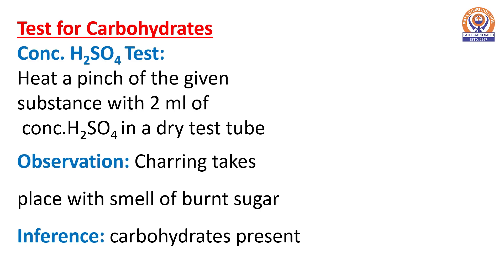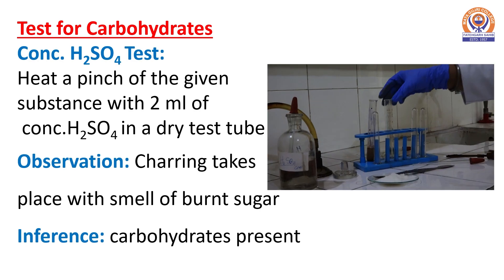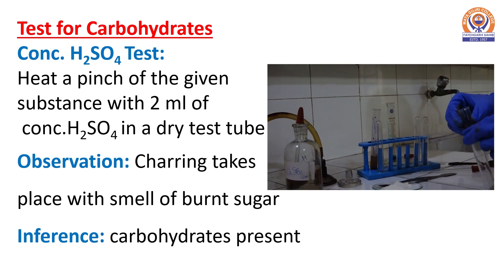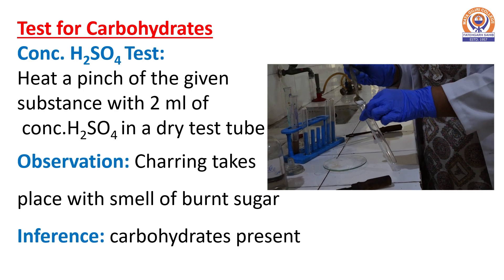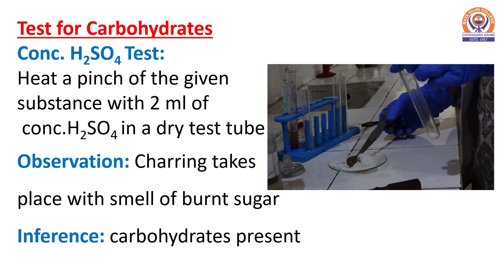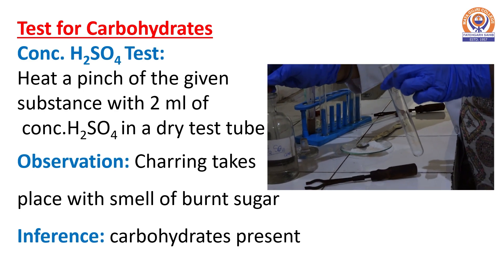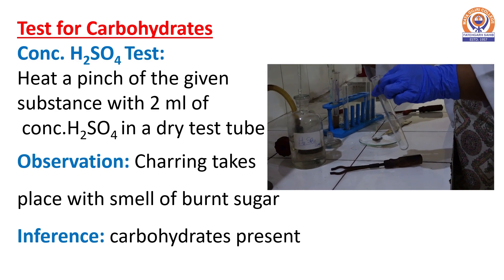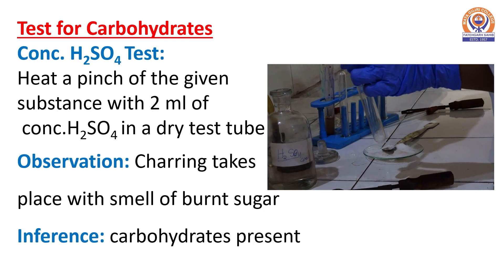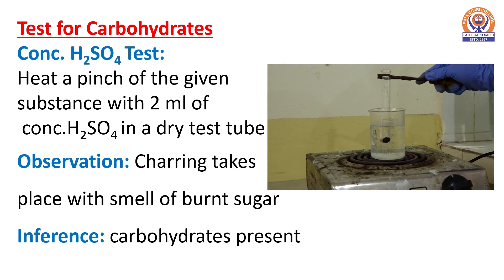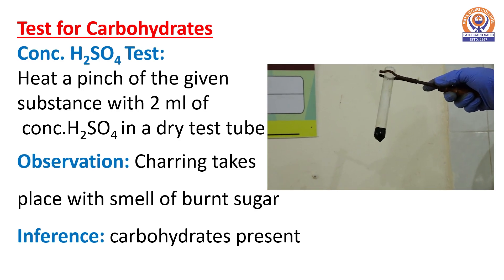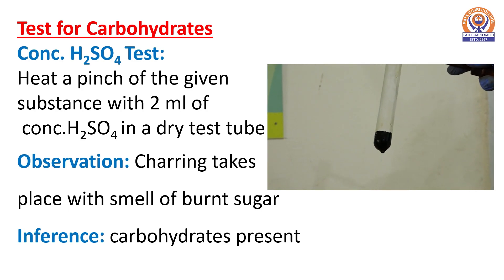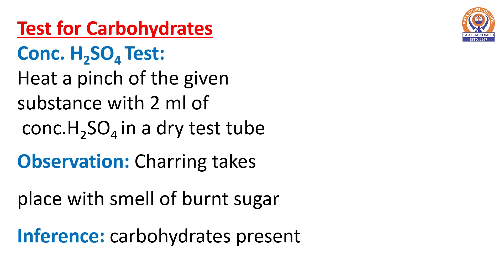For the concentrated H2SO4 test, we heat a pinch of the given substance with 2 ml of concentrated H2SO4 in a dry test tube. The observation is that charring takes place with the smell of burnt sugar. If charring occurs, this indicates that a carbohydrate is present.